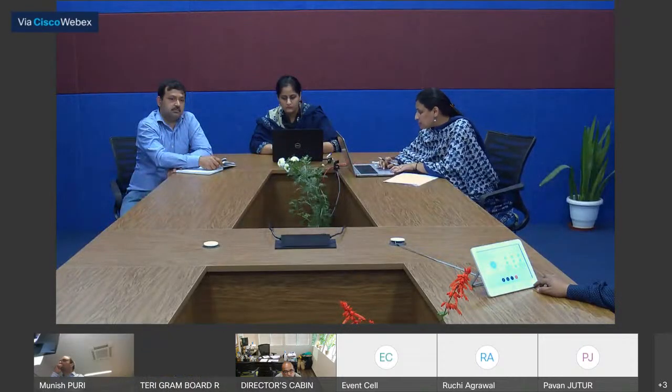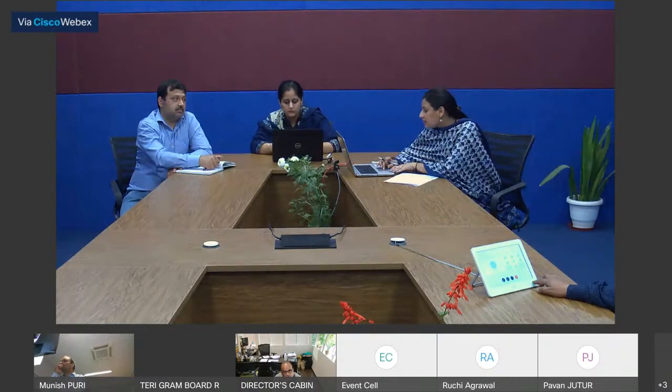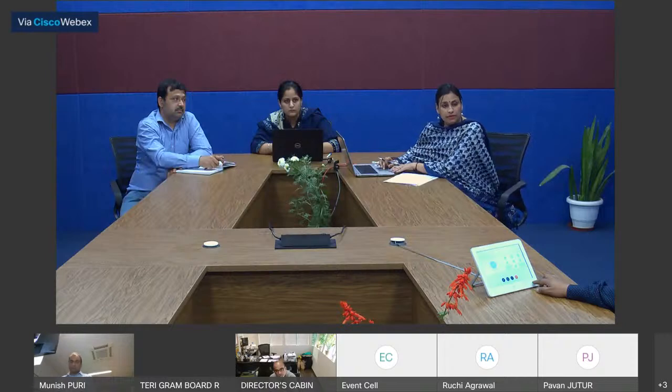Another question is from Dr. Ambati, and the question is, did you try any other enzymes for extraction methods instead of lipase? And is it economically viable?